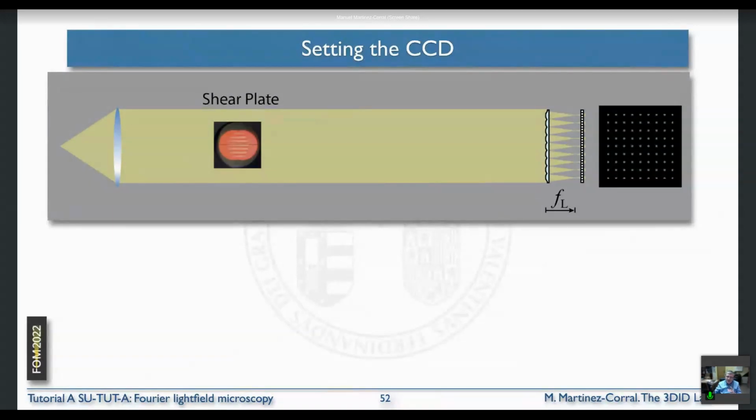So we define one optical axis, and let us suppose that we know how to make them perpendicular to the optical axis. So the first thing we do is prepare a parallel beam.